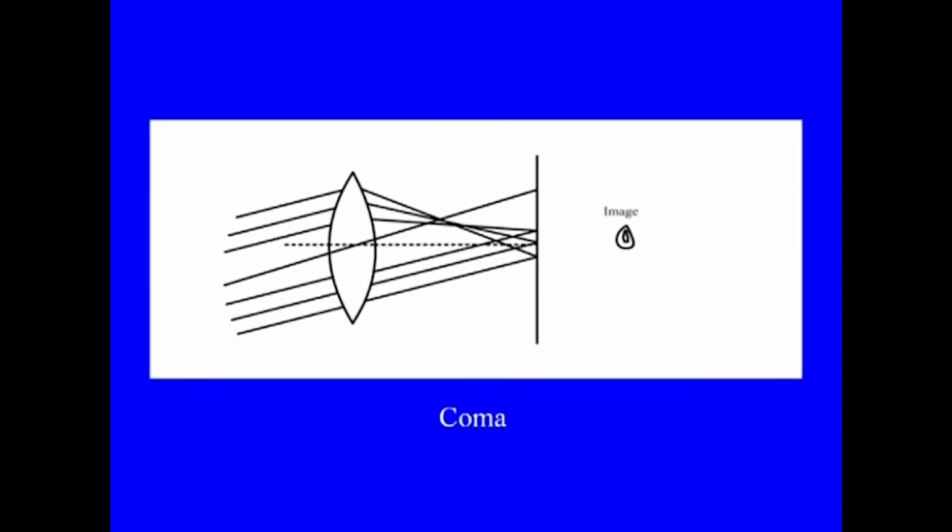There is one point imaging aberration I just wanted to show here, that is coma, because it gives a comet shape to the object in the image plane, and the symmetry is almost lost here. So, these were two aberrations which were common, but now in advanced systems these have been corrected with combinations of lens systems. So, this was about geometric optics.